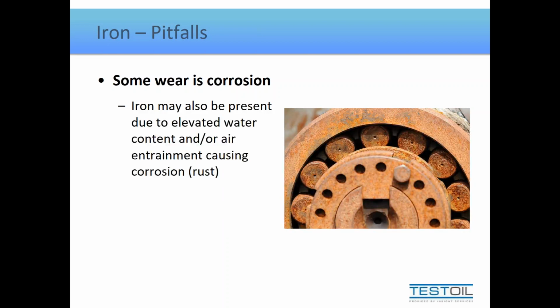So if you know you've got a high humidity atmosphere, or if the machine happens to sit idle for extended periods of time, it is possible that parts within the machine will corrode, and that when brought into service and lubricant circulates over these parts and some of them start interfering, rubbing against each other, those rust particles will come off and they will show up in the oil analysis results. So when we do get a spike in iron and only iron, we can attribute that at times to just being a type of rust rather than a true physical, like I said, abrasive or adhesive wear.